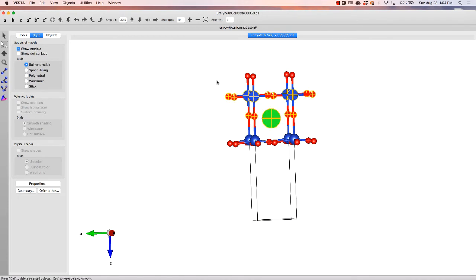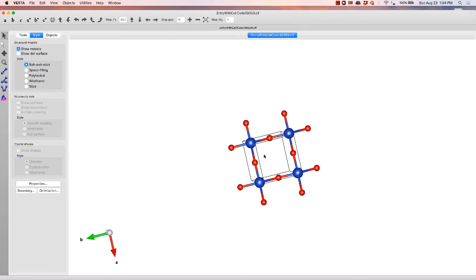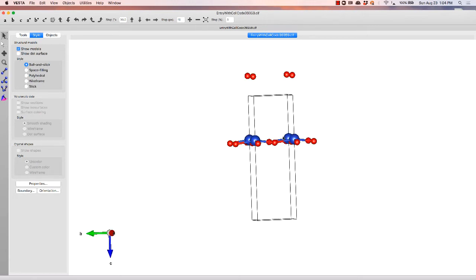delete those up here, rotate, and we start to see that we have this square network of oxygen and copper. Control Z to get those bad boys back.